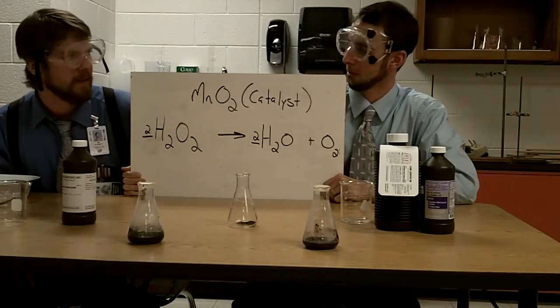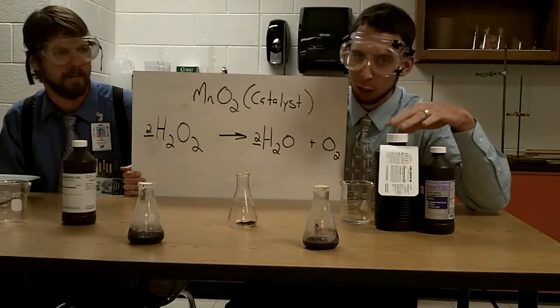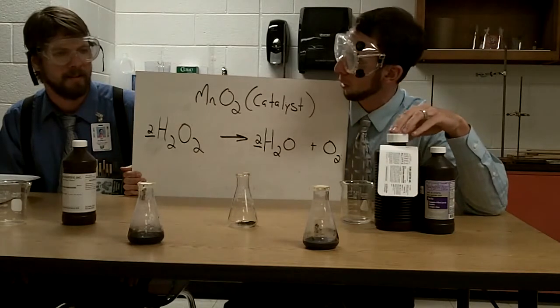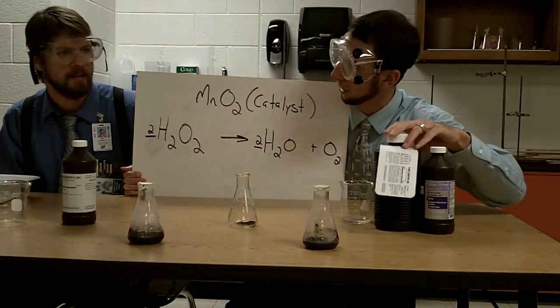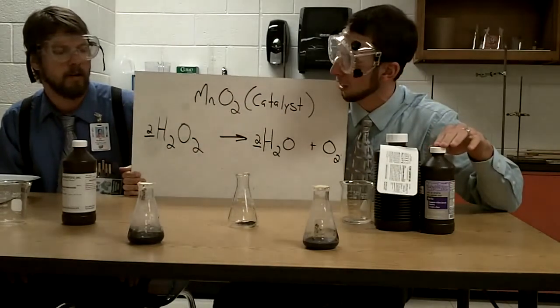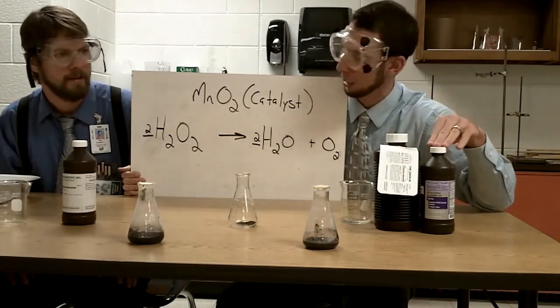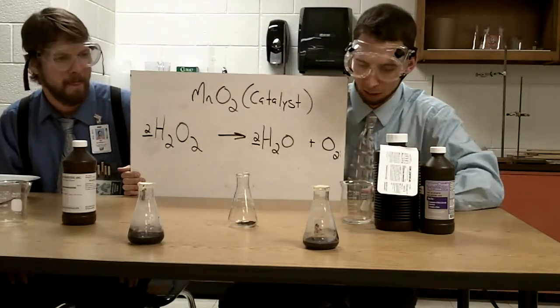Well, Mr. Burnett, I certainly hope so. What we've done is got 30% hydrogen peroxide in the slinky bottle. And what were the other ones? This was 6%, and this was only 3%. All right. So this is literally 10 times the strength of this. I like it. All right. So here we go.